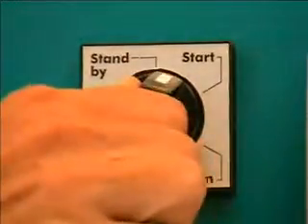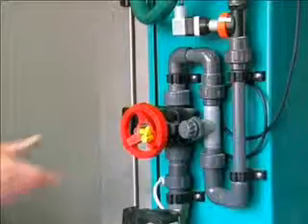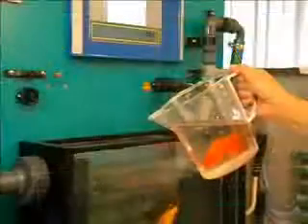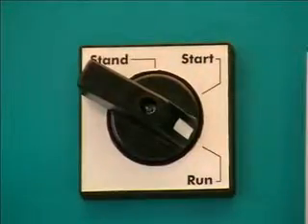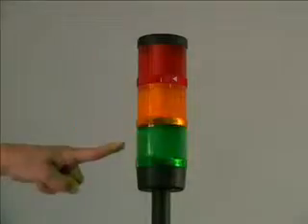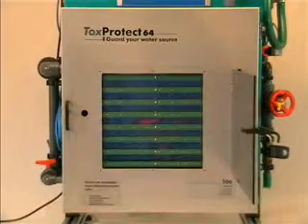To quick start the instrument, check the necessary hose connections and ensure that there is a free drain. Place the mode switch in the start-up position. This will start the instrument without giving toxicity or hardware alarms. The green traffic light on the top of the instrument will then start blinking. Regulate the flow control valve on the right side of the instrument and check whether there is enough food in the automatic feeder. Refill if necessary. Add the fish to the aquarium. Mount the automatic feeder and close the door. Turn the switch to the run mode. Answer the questions on the display panel and enter the number of fish if necessary. Measurements will now start. The instrument should then not be opened to prevent hardware alarms. To observe the fish, simply open the glass panel in the front door.